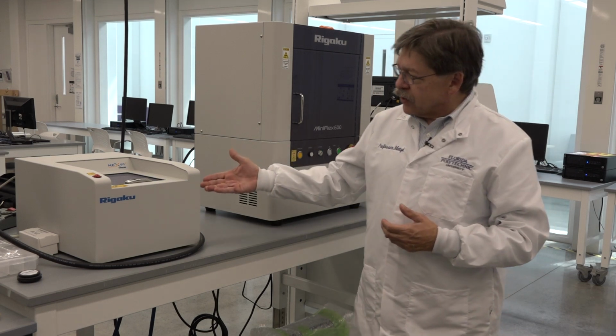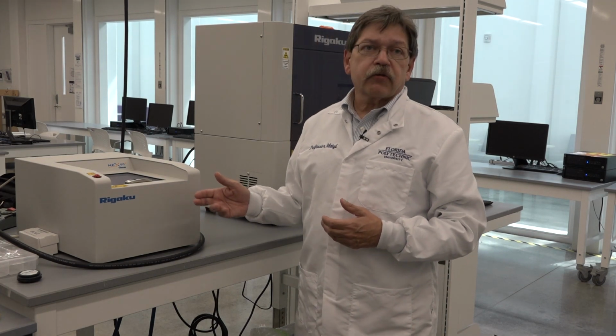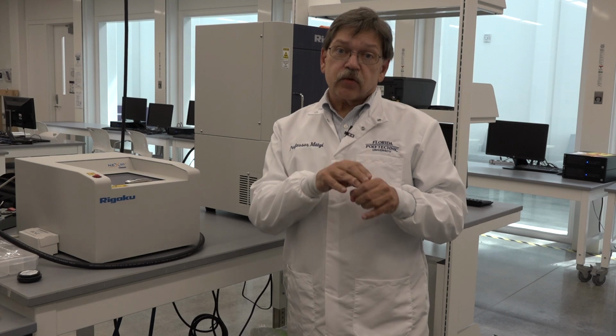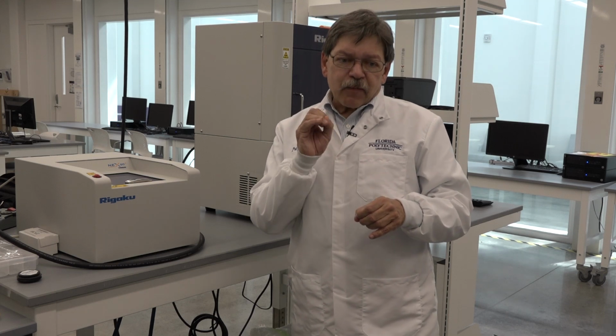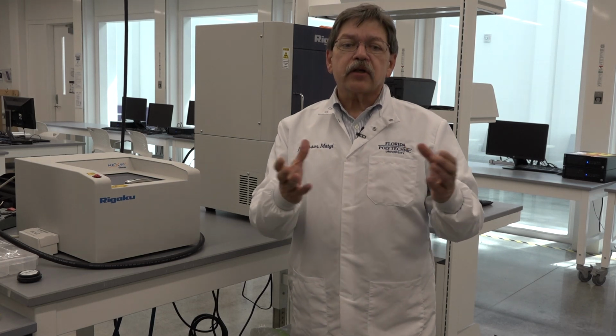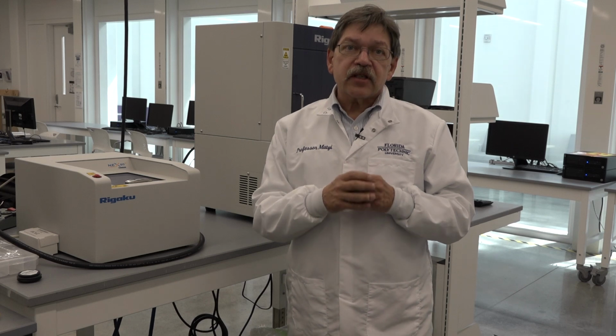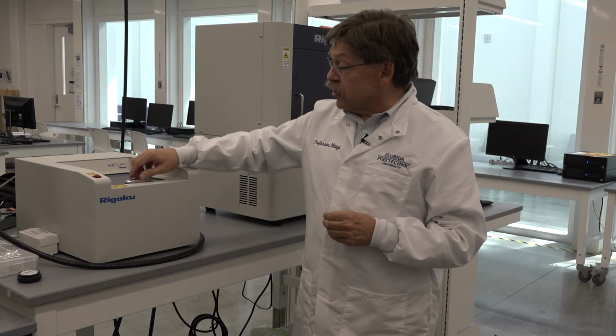Over here, this is not a toaster, this is an X-ray fluorescence system. X-ray fluorescence is a physical process by which you shine X-rays onto a sample, and that process of irradiating a sample causes the sample to emit X-rays whose energies are characteristic of the elements inside that sample. It's a very simple tool.